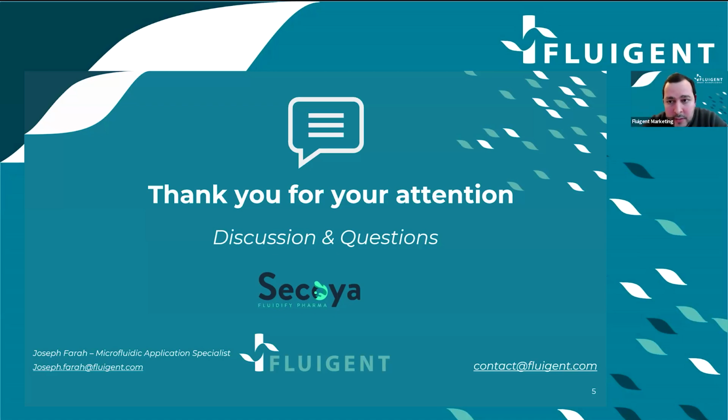Thank you, Leon. A question about the setup: by which method is real-time monitoring performed and which parameters does it provide? I'm thinking more about the microscope or the fast camera that we are using to see directly the generation of the droplets.